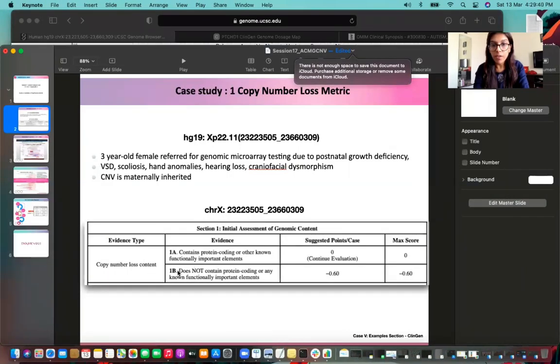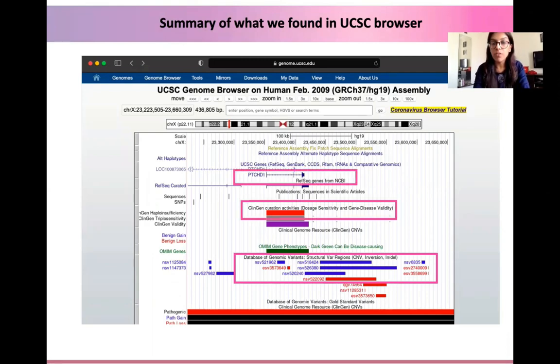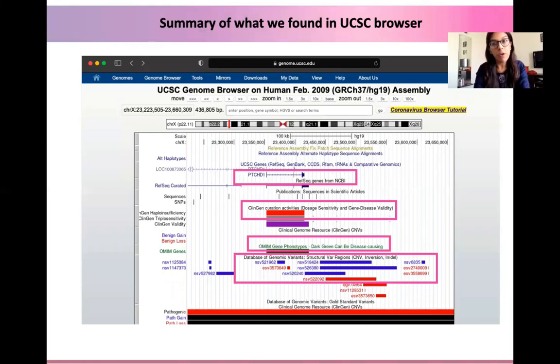We consider section 1A because the CNV does contain protein coding genes. To summarize what we saw in the UCSC browser: it contains one protein coding gene, it overlaps with the ClinGen dosage sensitivity map, it has an OMIM phenotype that is disease-causing, and in the DGV population-scale database it does not represent common variation.